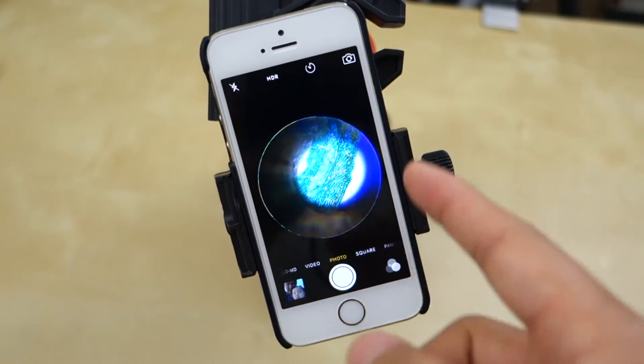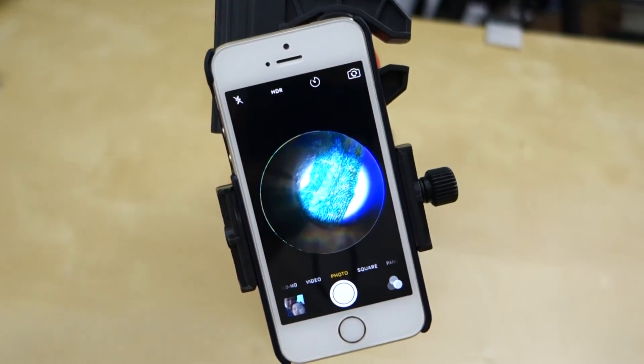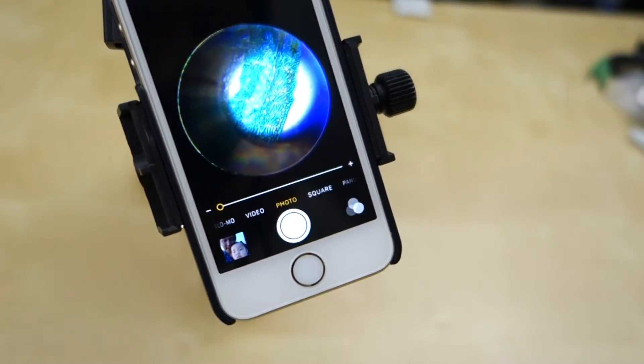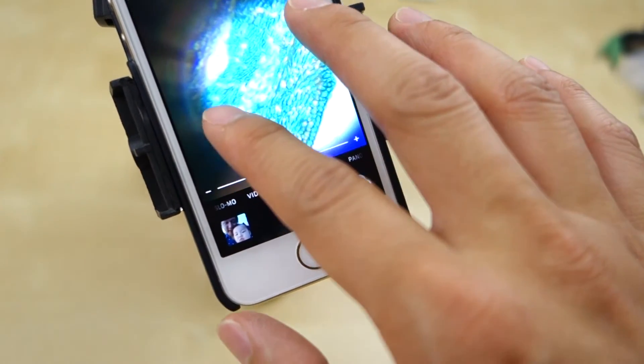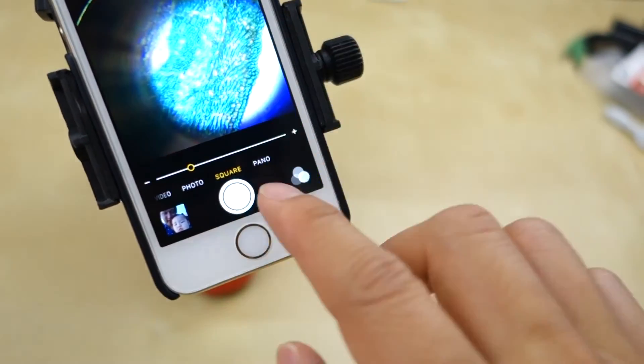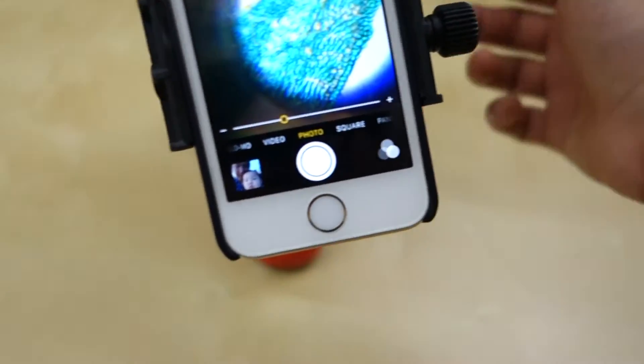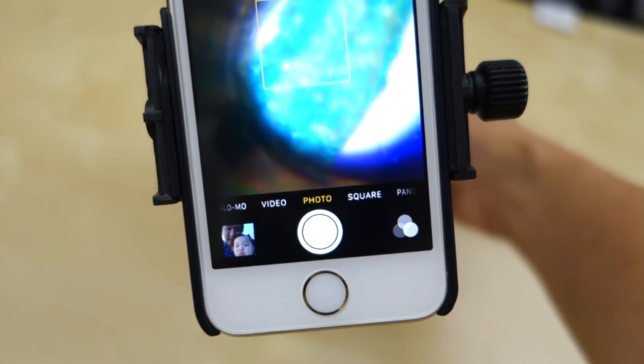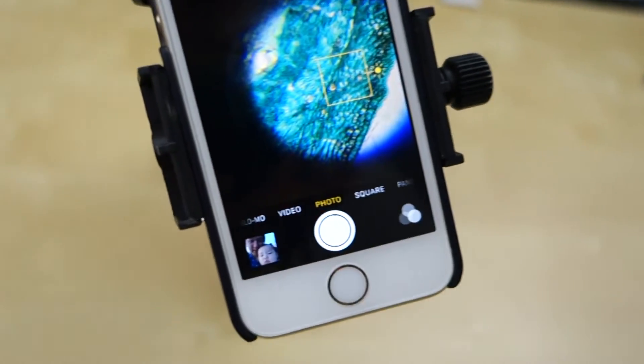So here's pretty much what it looks like. I have the camera lined up to the eyepiece. And then you can see that's pretty much what you get, just a small view. So definitely you do need to digitally zoom in a little bit. If your camera has digital or optical, it doesn't matter. But you definitely need to zoom in just a little bit. And just like this, and you can see, and you can make adjustment on the focus knob here. And to get it in focus, just like that. And then your camera can focus by tapping on it.